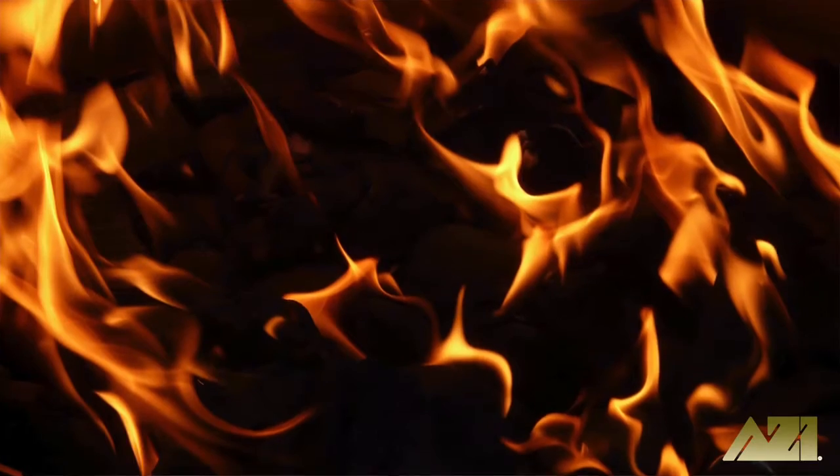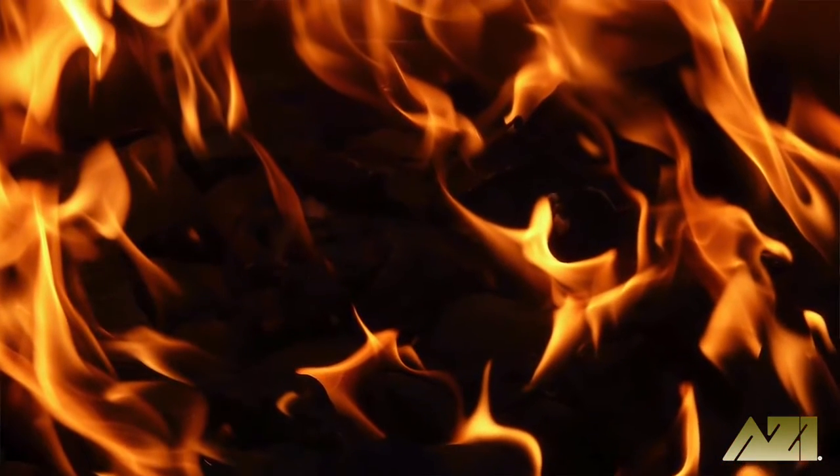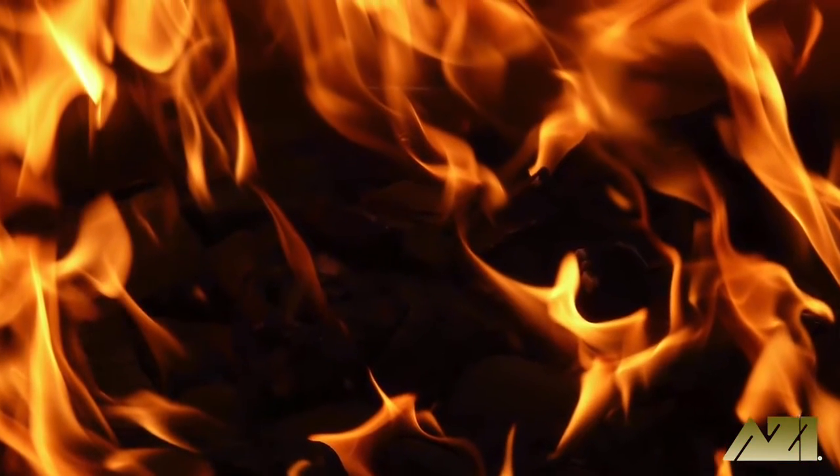Too much moisture also inhibits heat intensity because more energy is used driving off the moisture rather than burning the wood.